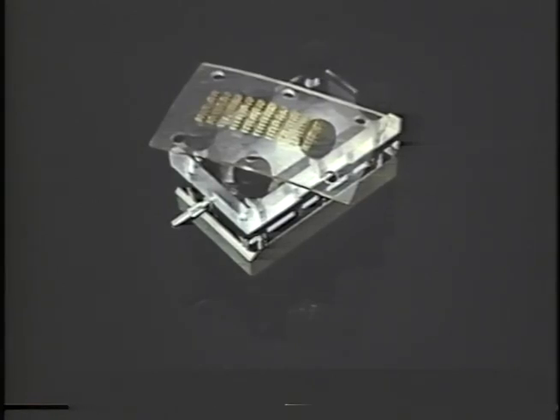After the grids are dried, the next step is staining the grids. In the past, I used a Hiraoka stainer for staining 40 grids at a time. But for some of our serial reconstructions, we found 40 grids at a time not to be enough. So we built our own modification of a Hiraoka stainer, which has a grid plate that holds 100 grids. And the whole staining apparatus is shown in the next slide.